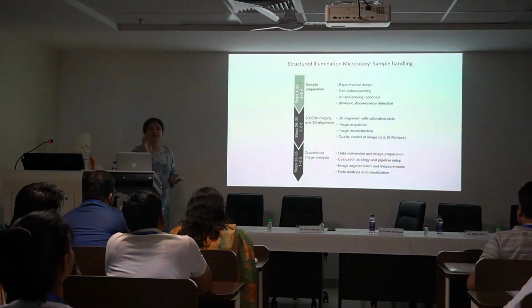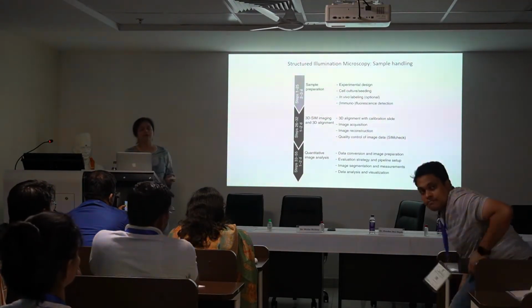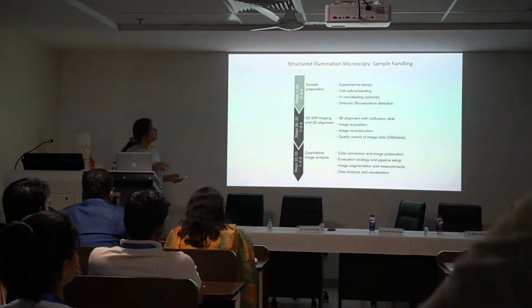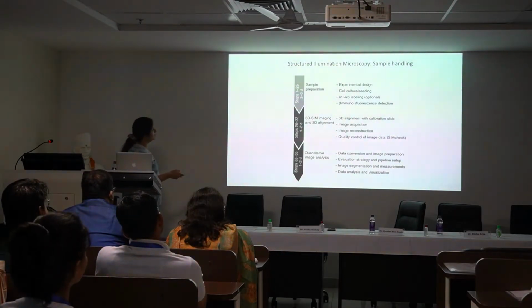It may be a very simple method which will actually allow us to look at living samples at a very high resolution. Something that may even surpass the other super resolution methods present in today's age.